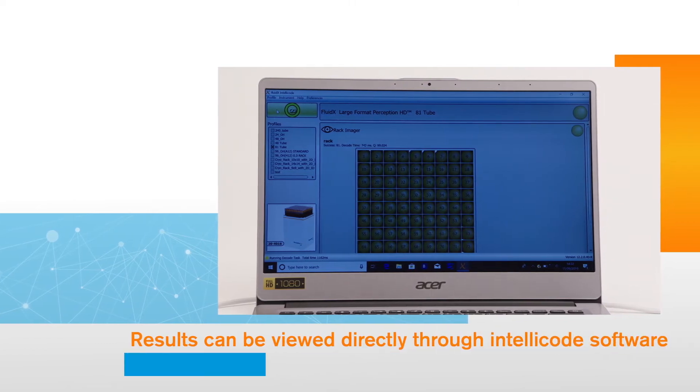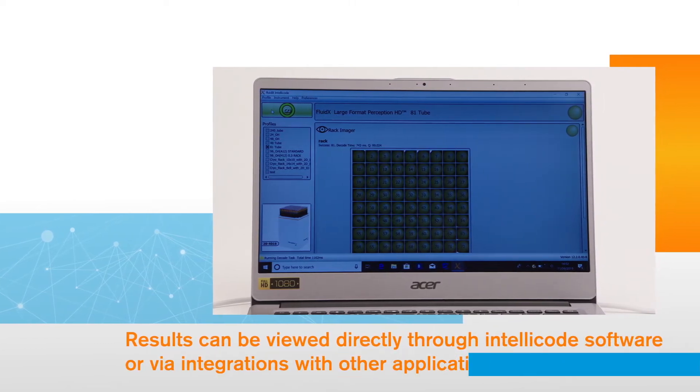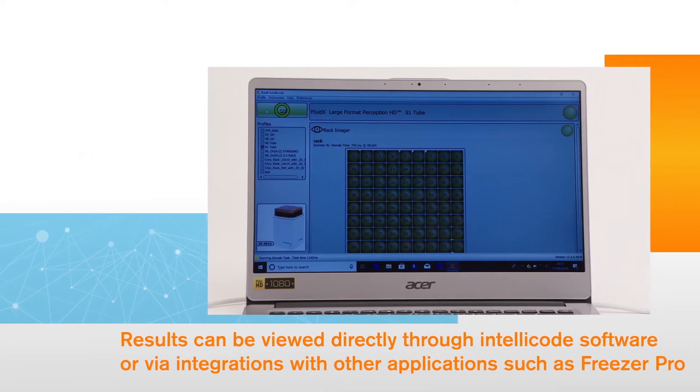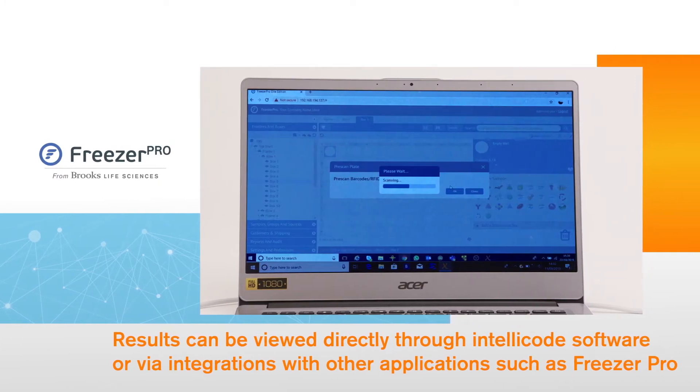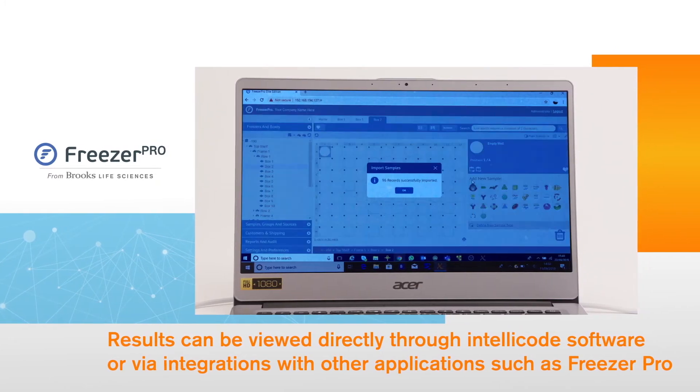The results can be viewed directly through IntelliCode software or via integrations with other applications such as Freezer Pro, as seen here where you can scan tubes into the software directly.